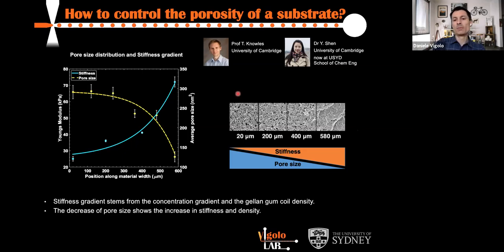At the same time, this also gave us a visual confirmation that we really have a different concentration at different locations. Not that we needed additional proof, but it is always nice to see a real picture of a tightly packed structure at the stiffer side and a much larger pore size, so a lower concentration overall, at the softer side.